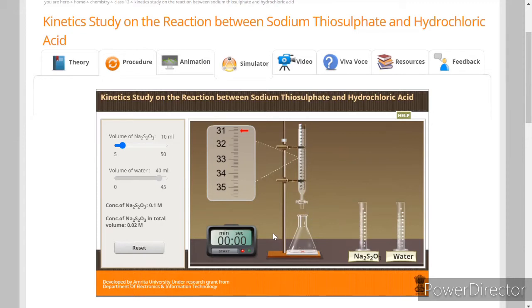Okay, it's in the conical flask, and then we pour the water, click, and release. So the solution is already in the flask. And then we click the stopcock to make the hydrochloric acid drip from the burette.